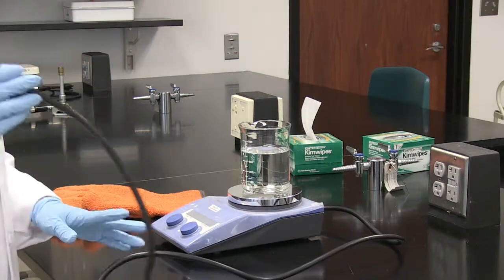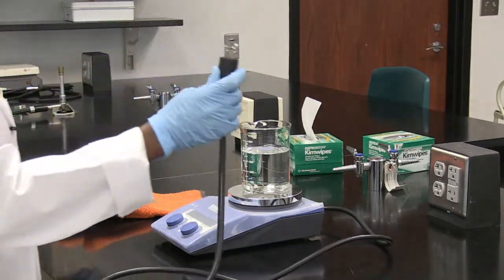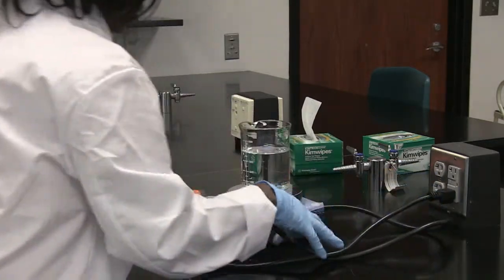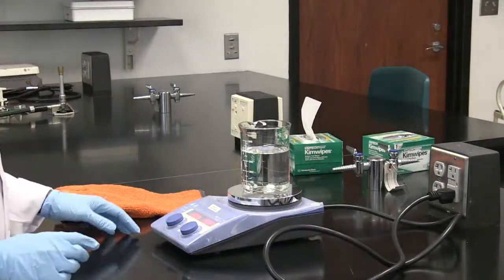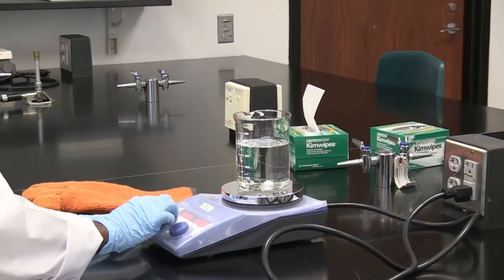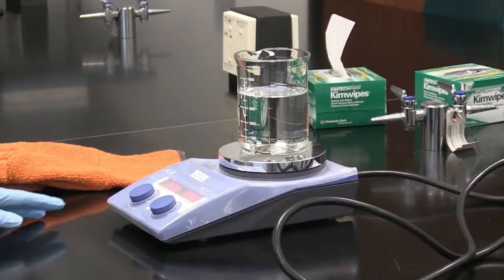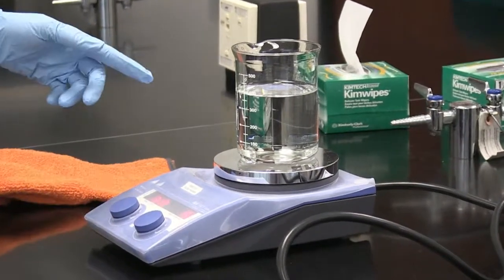For example, I'm going to use this hot plate to boil water. I make sure I plug in the plate and then turn the dial to whatever temperature I want to keep the hot plate at to boil my water.